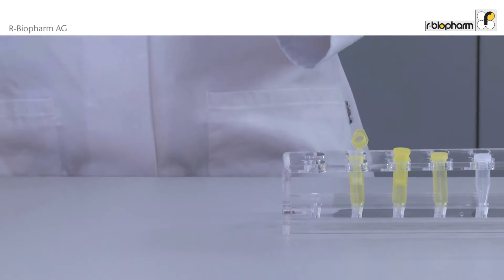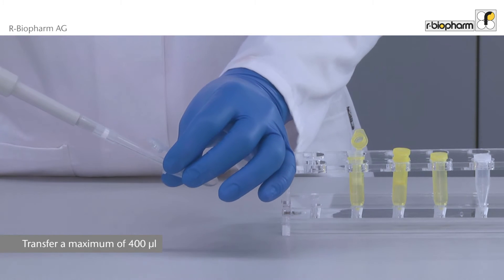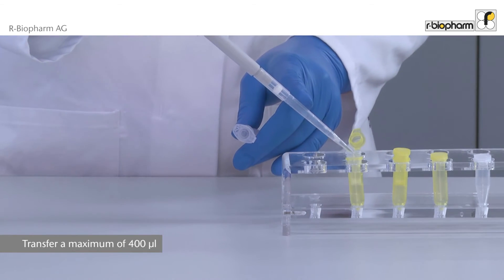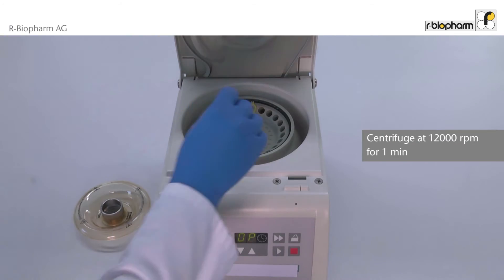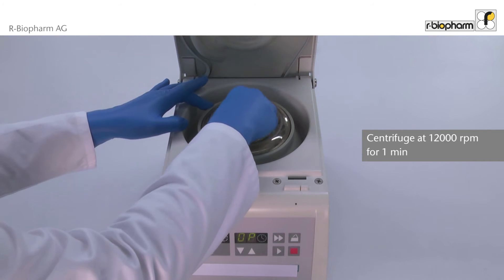After the centrifugation, take a maximum of 40 microliters and transfer the liquid directly onto the clear spin filter in the yellow receiver tube. Centrifuge the yellow receiver tube with the spin filter at 12,000 rpm for one minute.